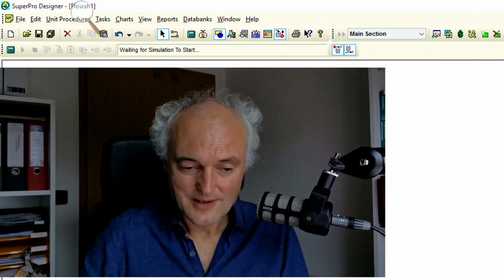so this is kind of the basic setup, and I think the most important thing at the beginning is just really try out this very simple setup. Play around a bit with that. I don't want to go further today because I'm not next to you. And things get frustrating with the software quite quickly if you realize that something doesn't work and nobody can help you. So what you should do now until Friday is, first, just try to get this simple process running yourself.